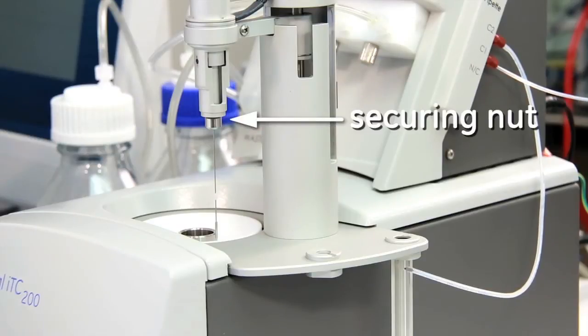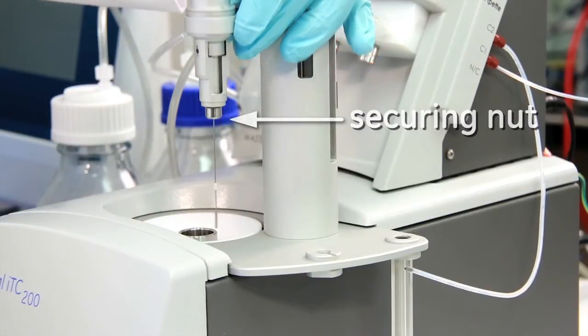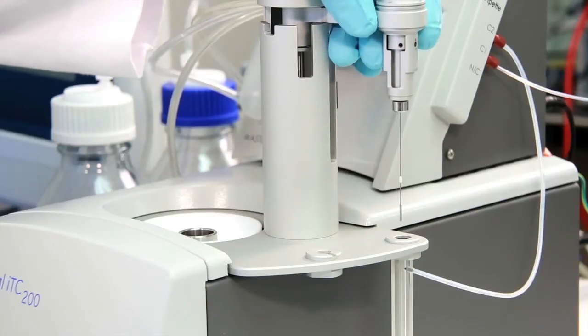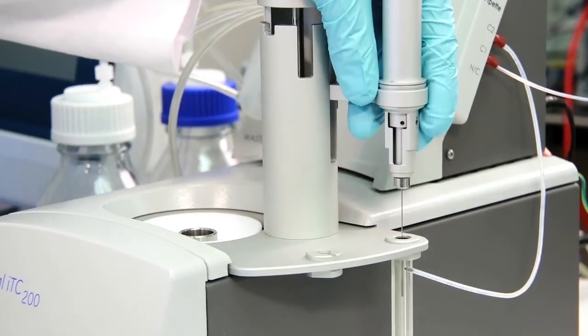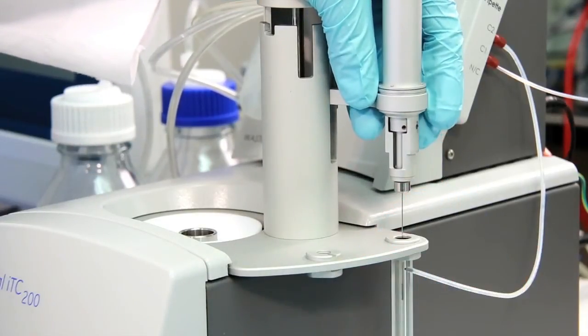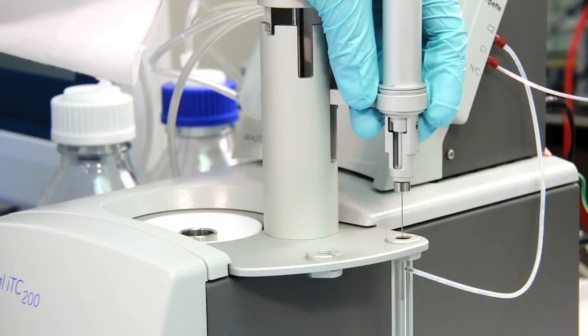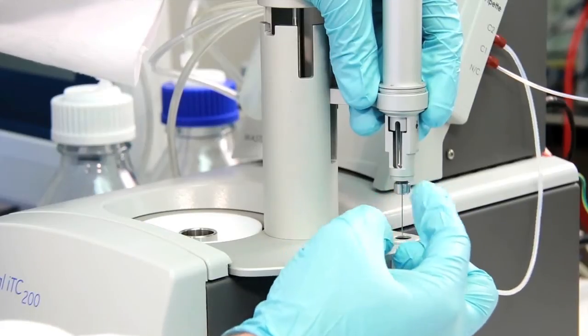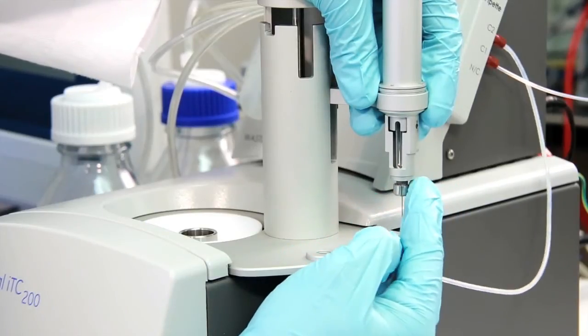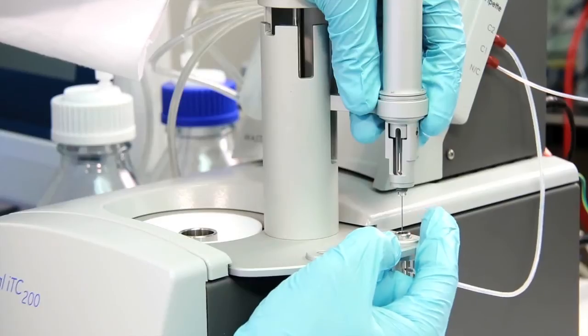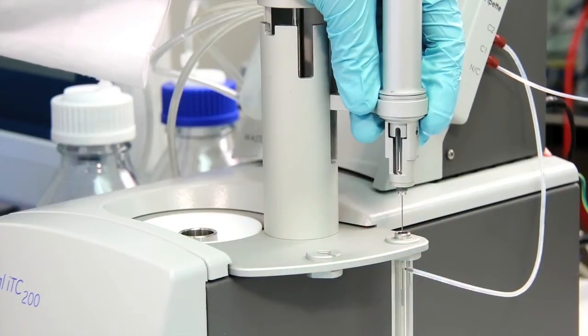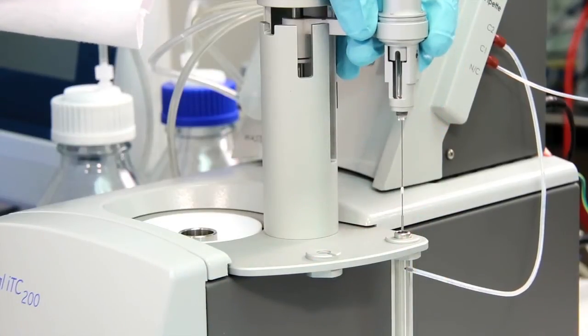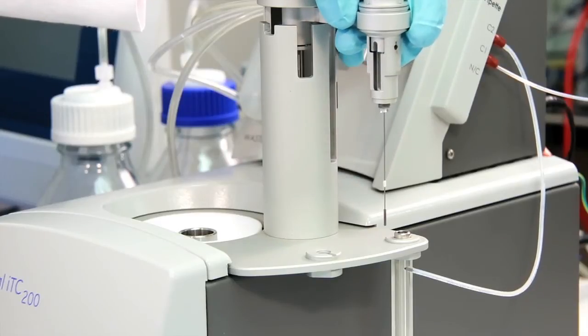To remove a syringe, we need to remove the securing nut. It's helpful to place the pipette partway into the wash station. With one hand, hold the rotating part of the pipette still while unscrewing the securing nut. Let the securing nut drop into the wash station and leave it there until you reinstall the syringe.